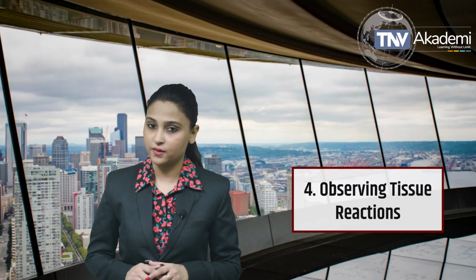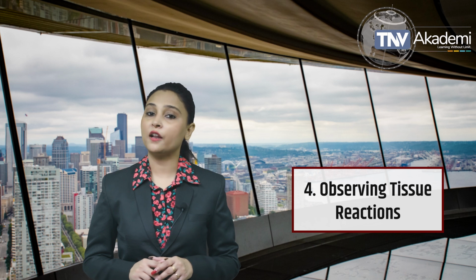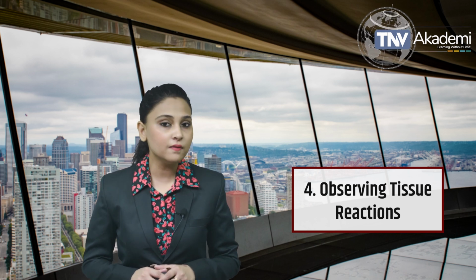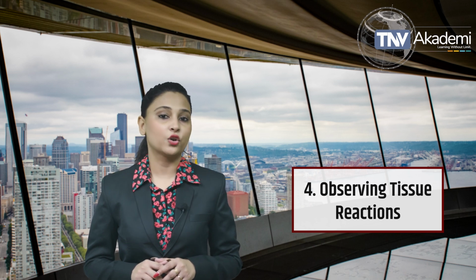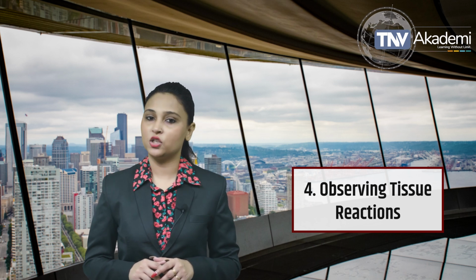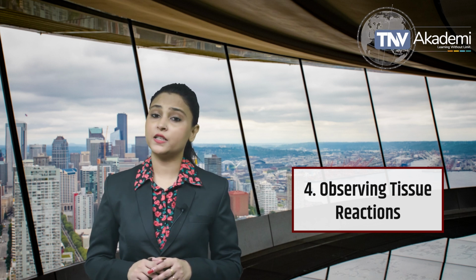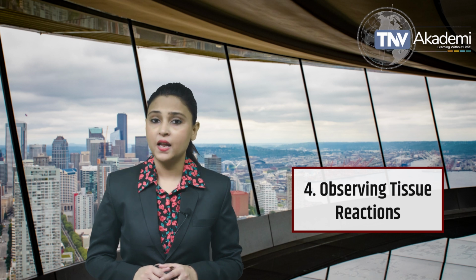Observing tissue reactions. After the implantation period, the surrounding tissue is carefully examined for biological responses. This involves assessing for inflammation, fibrosis, necrosis, or any other negative tissue changes. ISO 10993-6 specifies how these tissue reactions should be scored and interpreted.